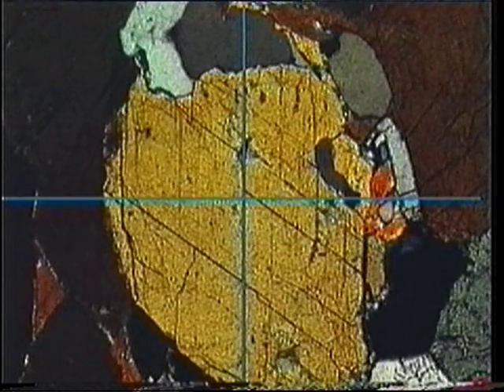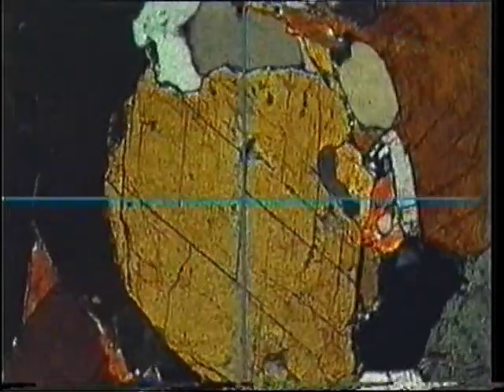To measure the angle between the two sets of cleavage traces, rotate the stage until one set is north-south and note the stage position in degrees. Then rotate the stage until the other set is north-south and note the stage reading again. The difference between the stage readings gives the acute angle between the cleavage traces, about 60 degrees.